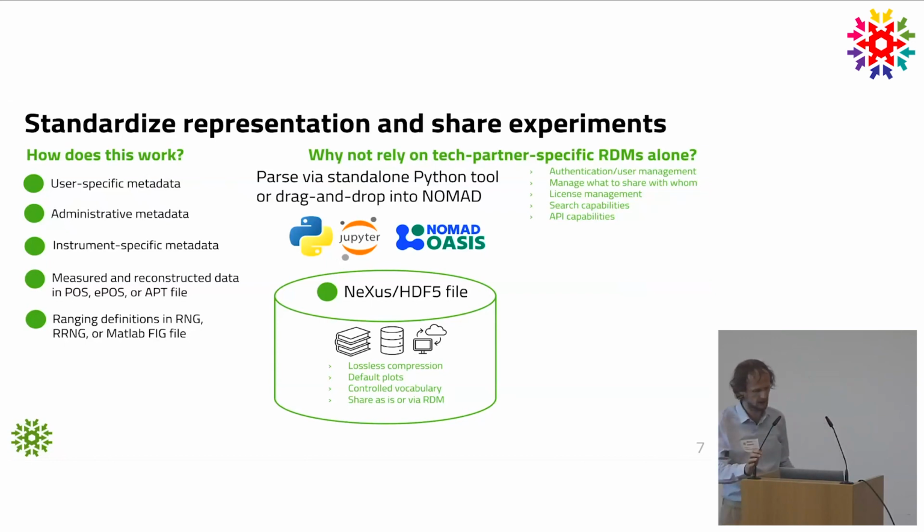What we then do, and that's all inside NOMAD, and it's a single mouse click, you just drop the file in it. If you want, you customize the ELN, customize in the sense that you just enter the data that fit your experiment, obviously, and don't have to program anything. And then that gets parsed, and you will get this HDF5 NeXus artifact inside NOMAD, with its capabilities.